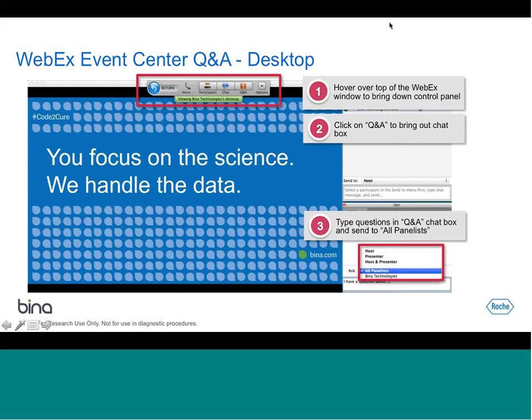Another question. Are you able to predict the false negative rate? False negative rate, so how many mutations you miss. In the data that we have presented, we are using the Dream Challenge as well as in-silico titration where we know the ground truth, so we could predict the false negative rate.